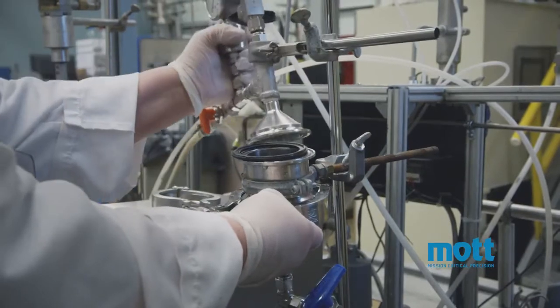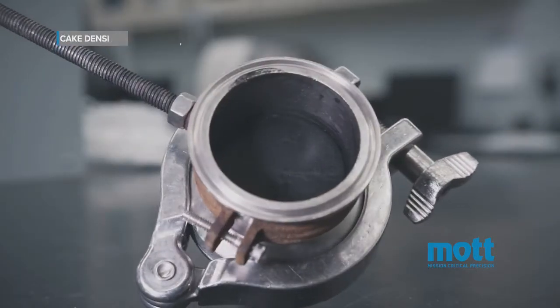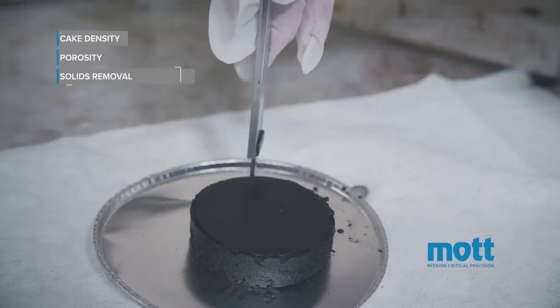The cake formed from initial filtration testing can be used to measure cake density, porosity, and solids removal efficiency.